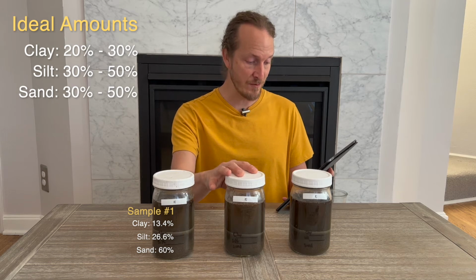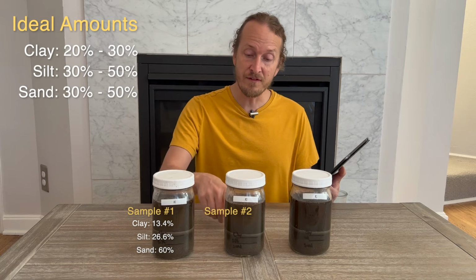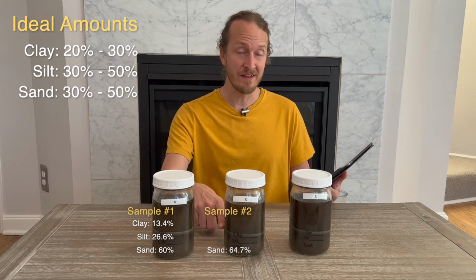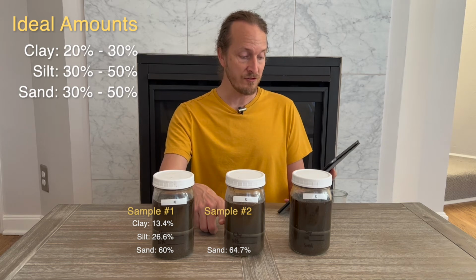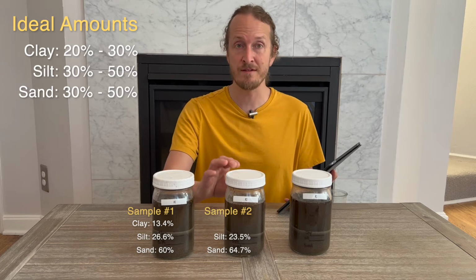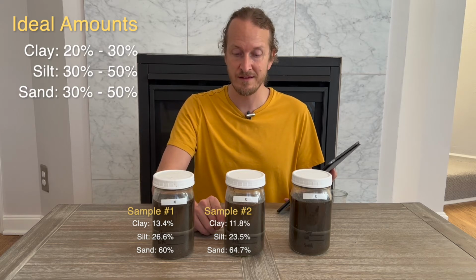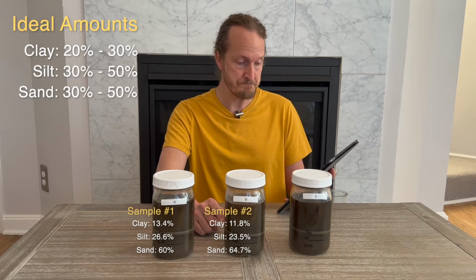Okay, so for the second one, we're going to see pretty similar results across the board. Out of the 51 millimeters total, 33 millimeters were sand. That's 64.7% sand, so quite a bit of sand. 12 millimeters of silt comes to 23.5% silt. And then only 6 millimeters of clay, which comes to 11.8%. So again, pretty heavy on the sand and light on the silt and the clay.